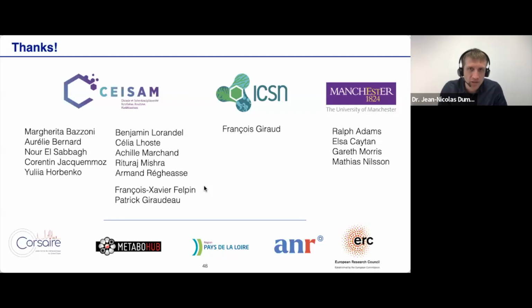One of the key advantages of 1D NMR is that you can do absolute quantification in the absence of a standard, which I suspect is what you are referring to as quantitative. And pure shift NMR in general is not quantitative in that sense. But you still have a linear response. You can do relative quantification, and you can calibrate in a number of ways. But you have a linear response with a coefficient that is compound dependent and peak dependent for a given compound. So yeah, you can do relative quantification, and you need calibration for absolute quantification in general.